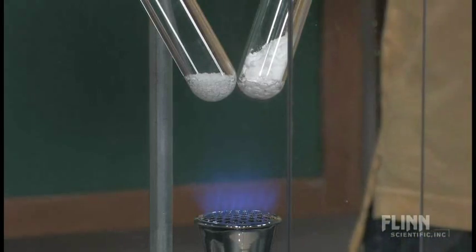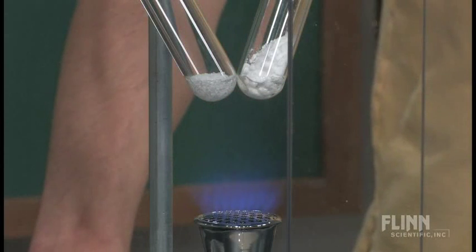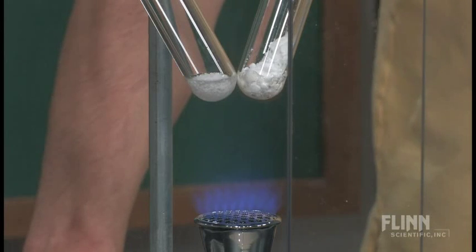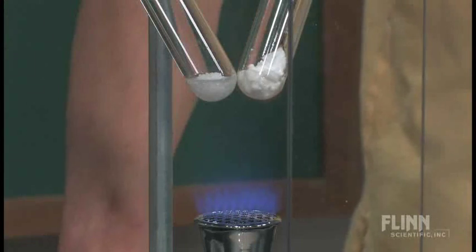Could take the gas down just a smidge. And a little bit more than that. You do want to watch that your flame does not get so high that you start to melt your test tubes. And as you can see, the sodium chlorate is already starting to go molten. The potassium chlorate is going molten.